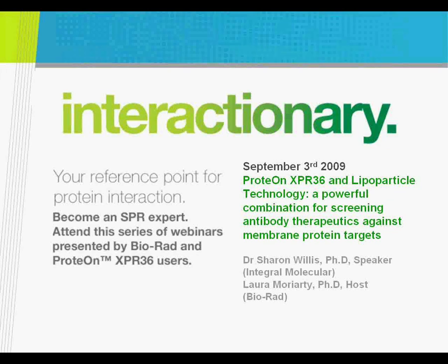We were able to measure them fairly well, but of course the issue is if you get a bit of drift with any of these things, then at, let's say, 100 picomolar and lower, that drift may start making quite a bit of difference to your accuracy.